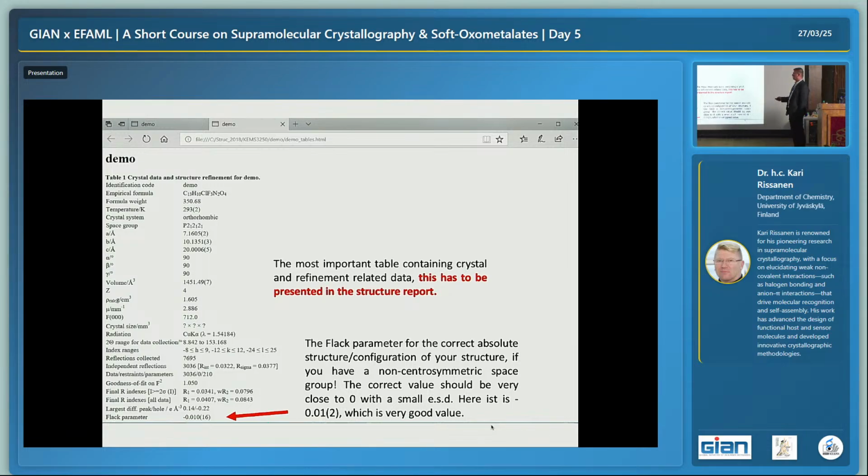And then if we look at b, so it's 10, here we go 12 to 12. And then in here, it's 20, so here it's 24, 25. So you can see we always aim that these hkl ranges are bigger than the respective axis lengths. It means that then we have a higher resolution. If they were the same, then it would be a 1 angstrom separation. In some cases, it would be. But typically we aim for more.